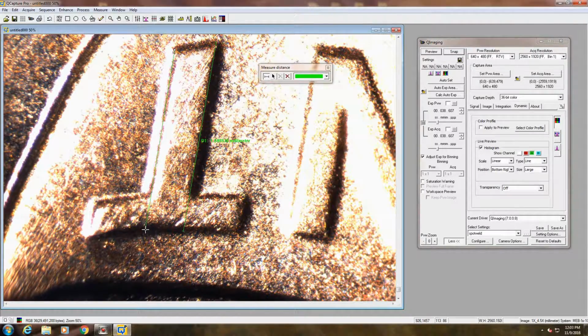And once you get a good feel for it, you should be able to do this relatively quickly. And there you go. You have two measurements. Now you can't see it in this case, but once you save the measurements, you should be able to. The image will darken, and you should be able to see it. Okay, what you do now, you can close that out.